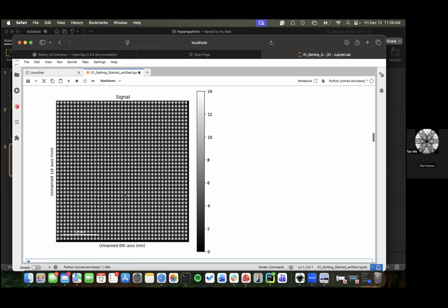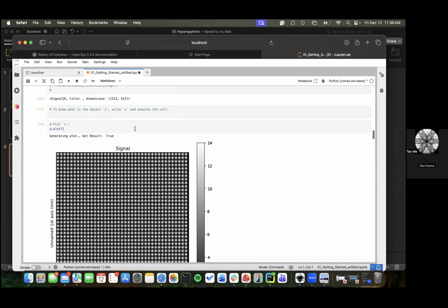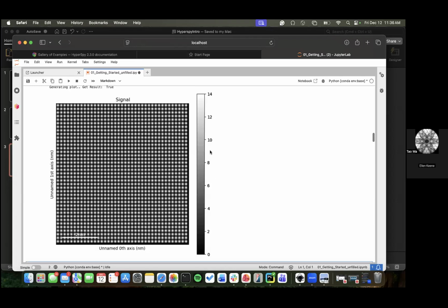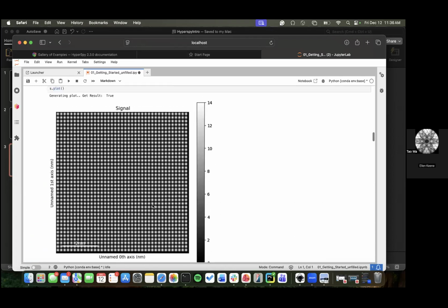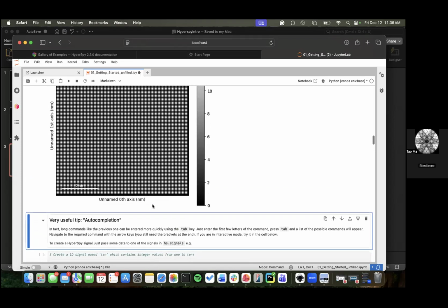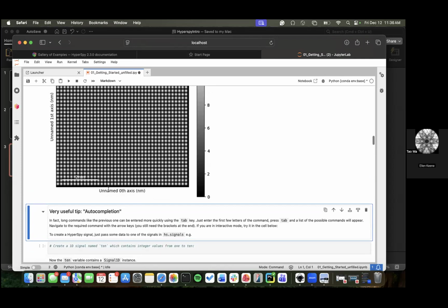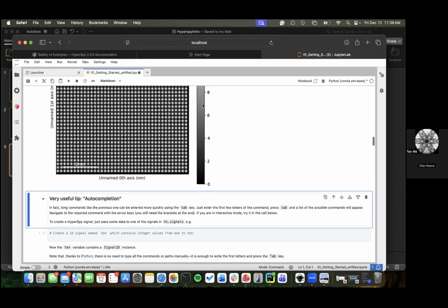You can see that this is a fake image of a bunch of different atoms, and kind of a little trippy to look at. This plotting right here is a nice feature. It comes with a scale, and it's generally an easy way to visualize. It also comes with a scale bar, and then you can see what the intensity of the image is.